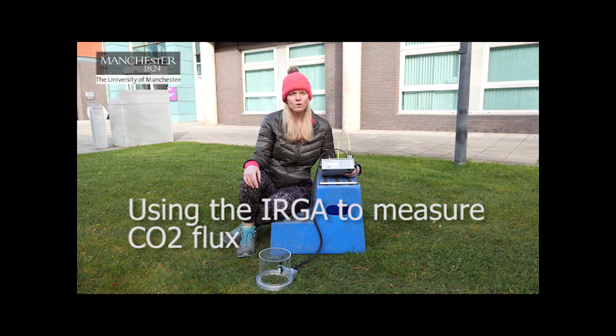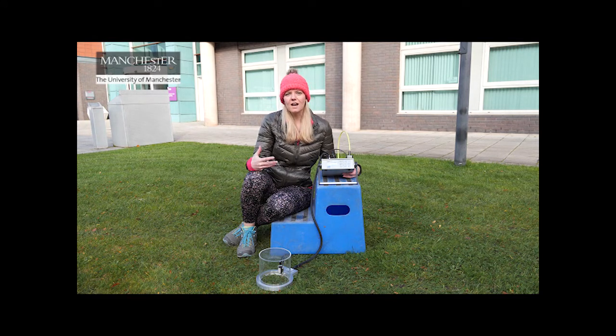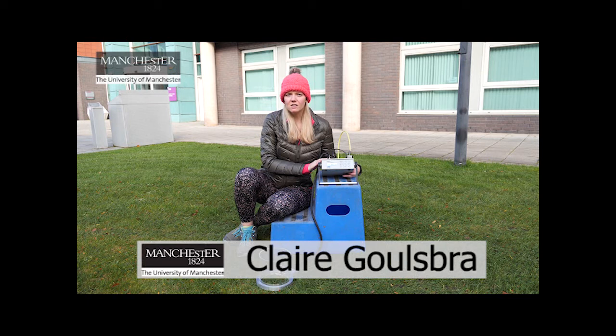Hi everyone. So we learned in the videos last week a little bit about the research design for the carbon dioxide flux practical, and we looked at how we sampled CO2 and the equipment that we used. So today we're going to have a look at that equipment in a little bit more detail and look at exactly how it works and what kind of data it allows you to collect.